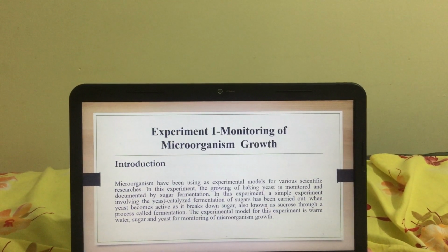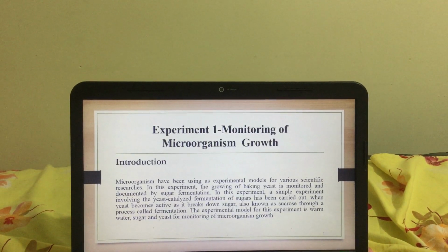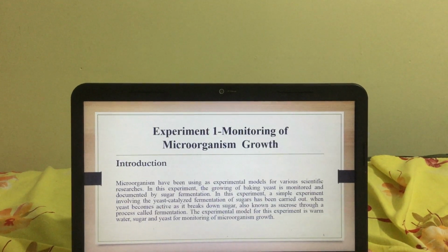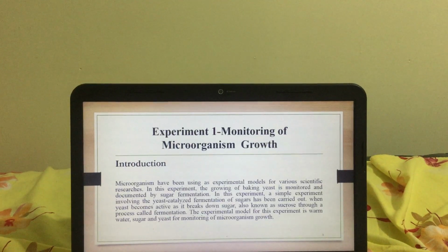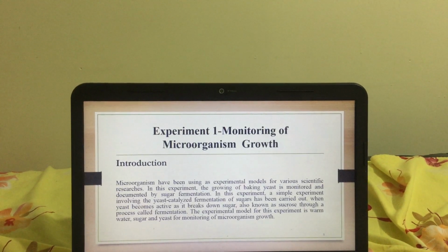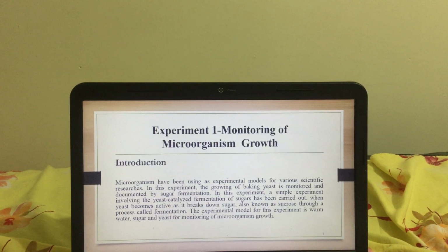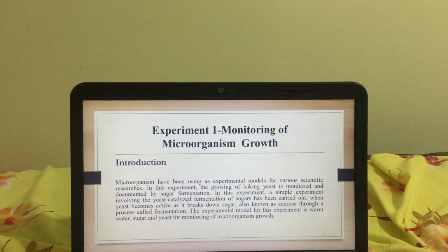I'm here to present my oral presentation on experiment 1, which is monitoring of microorganism growth. Microorganisms have been used as experimental models for various scientific researches. In this experiment, the growth of baking yeast is monitored and documented by sugar fermentation. A simple experiment involving the yeast-catalyzed fermentation of sugars has been carried out.